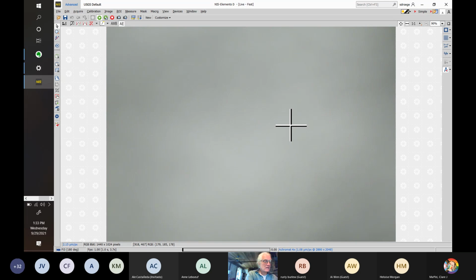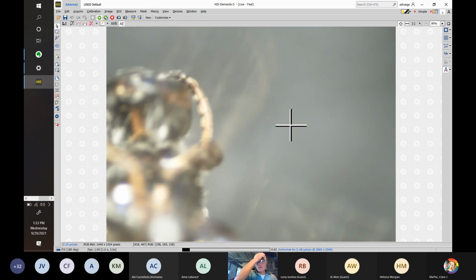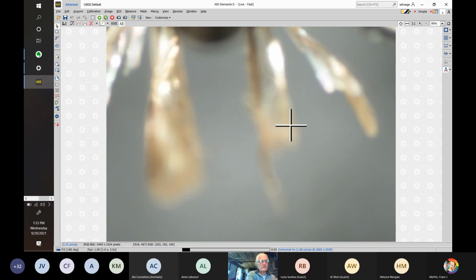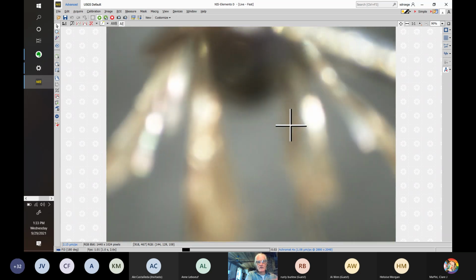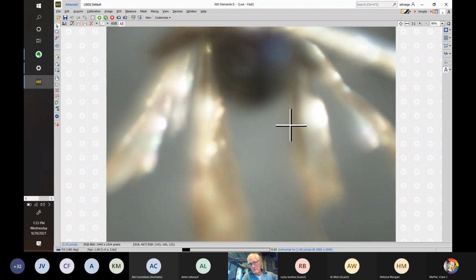Oh, is that the male? Yeah, so let me just point out that the rear ends of the males of this group also have lots of architecture that is useful at the species level. So the two introduced and the native one.